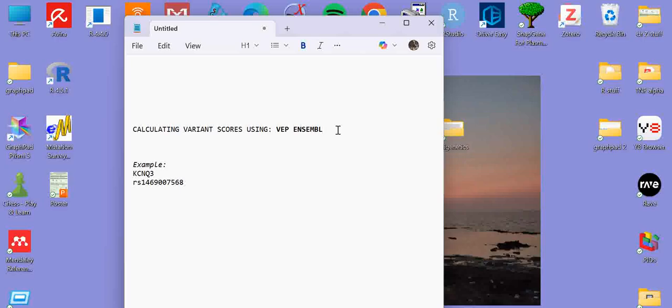He got his whole genome sequencing results and he wanted me to analyze them, and this is one website that I used to record the scores.